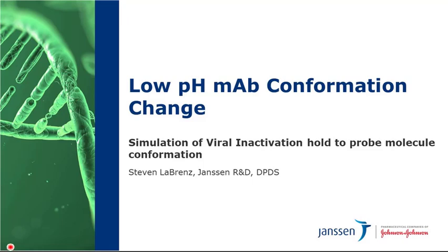Welcome to the portion of my talk where I'm going to discuss our work around a proof of concept to develop the process to simulate viral inactivation hold and looking at molecule conformation under those conditions as part of a purification development process.